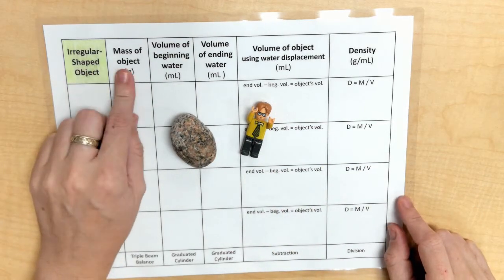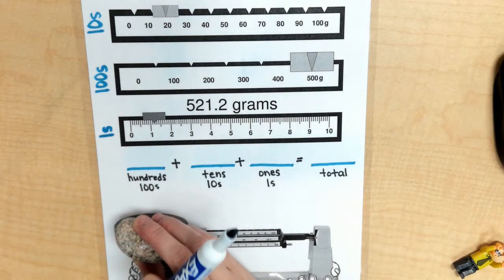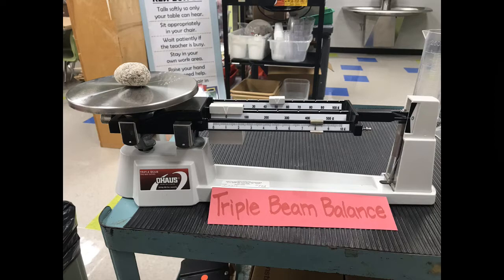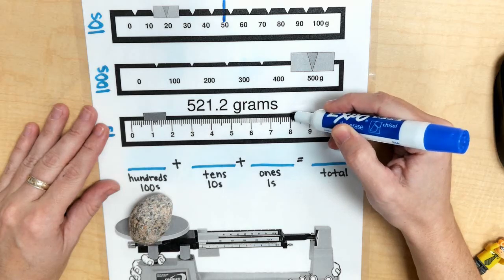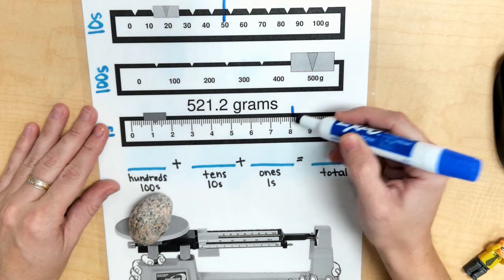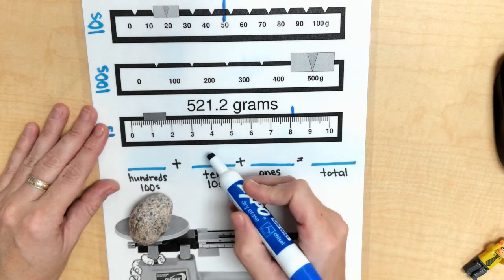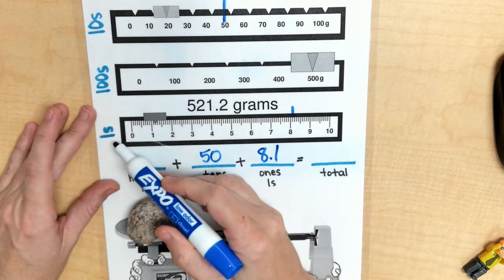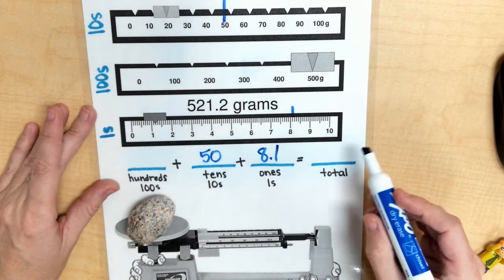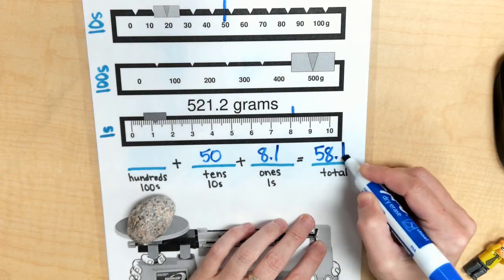So we're going to be figuring out the mass and the volume in order to figure out the density. With my rock, when I placed it on the triple beam balance, it went all the way to the 50 and then it went all the way to the 8 and then it went a little bit more. It went to the .1 spot after 8. So there were no hundreds, there were 50 tens, and there was 8.1 on my ones right here. So my total in grams for the mass of my rock was 58.1 grams.